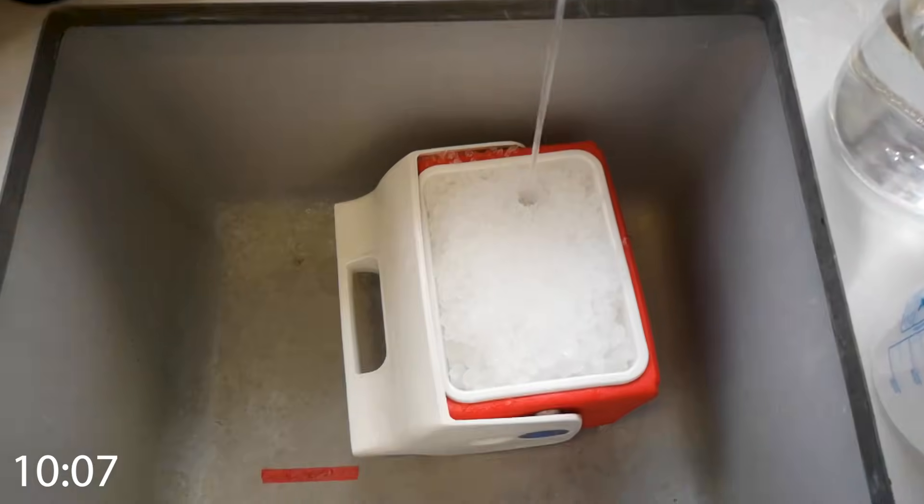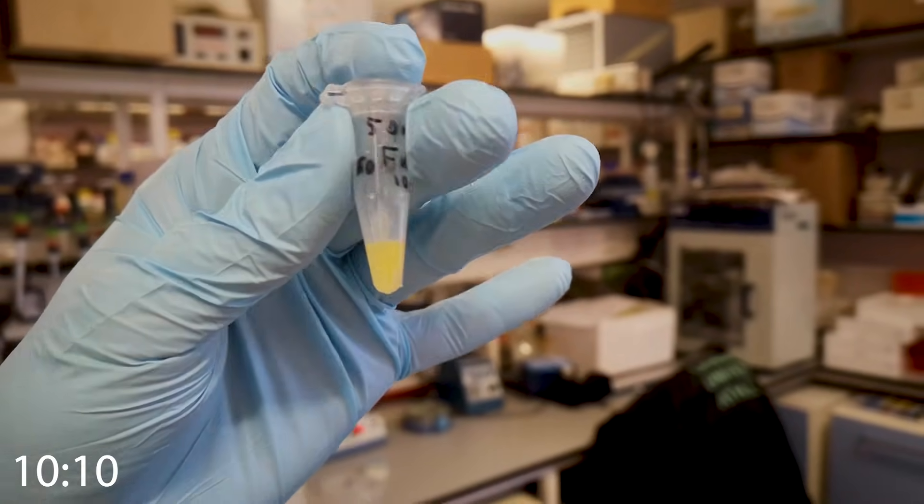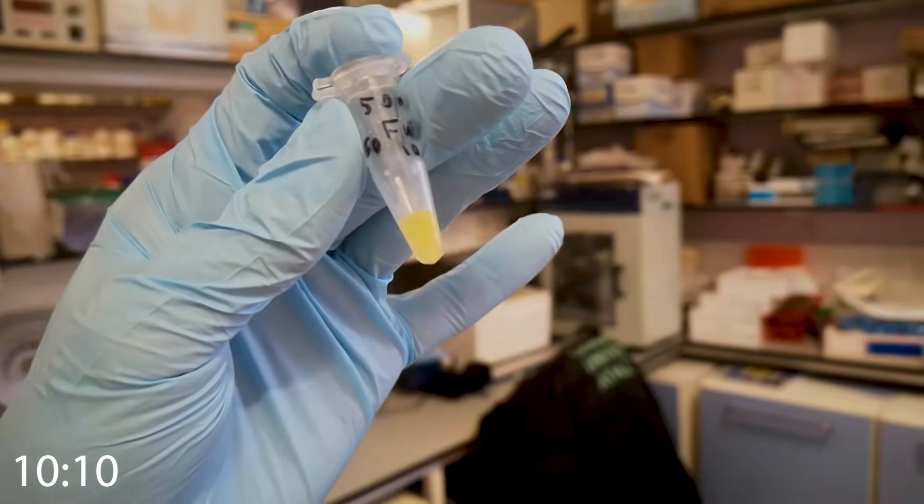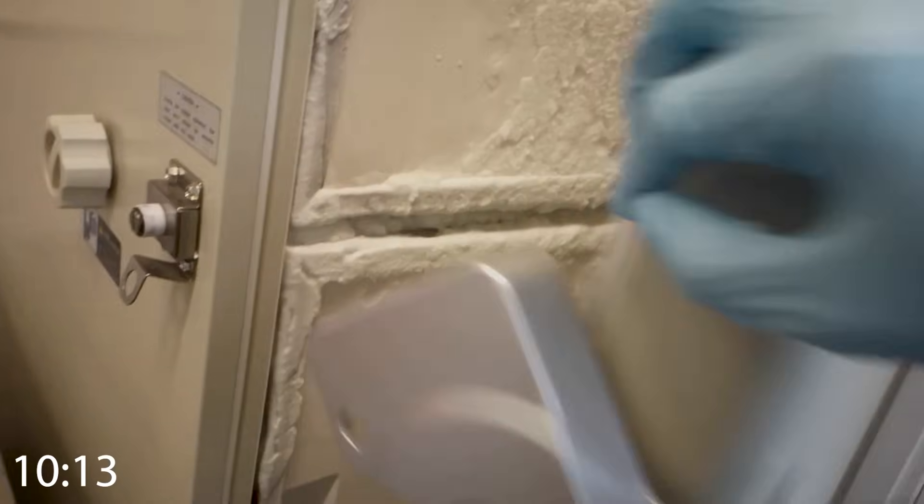I fill it with water to maximize heat transfer and then grab some super toxic chemicals that cost more than Gucci. I then take the elevator from hell to the basement and crack open the Antarctic freezer to fetch some of my samples.